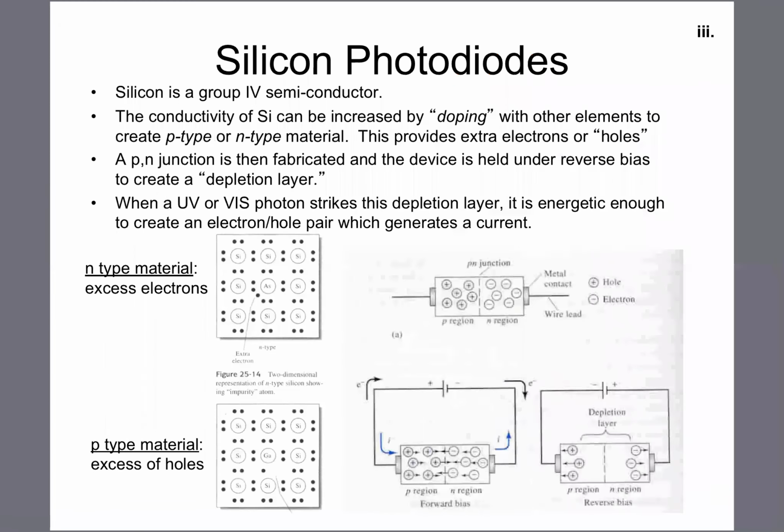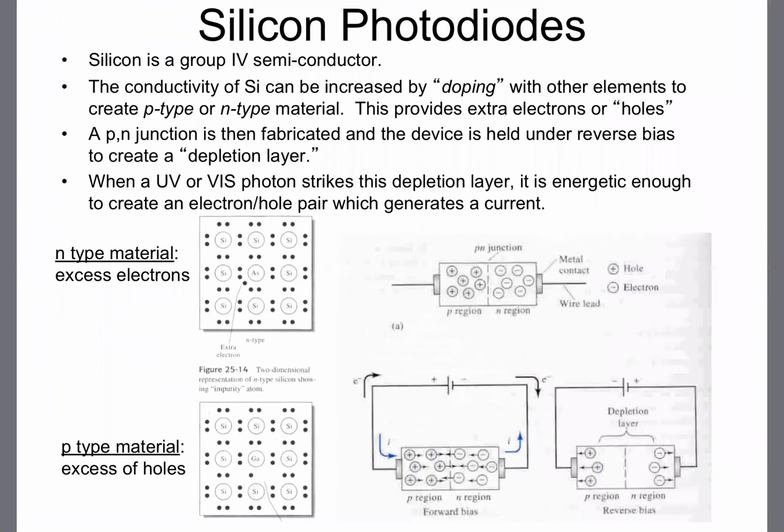devices. Now, silicon photodiodes, another type of light detectors. These are solid state light detectors, which are much more recent or modern. Very interesting how they function. Basically, what we're going to do is we're going to make some semiconductor material. Now, usually when you hear about semiconductors, right, you think of like Silicon Valley, right? Well, and the name even here is silicon photodiodes. So what you're basically going to start with to make a semiconductor is some silicon.